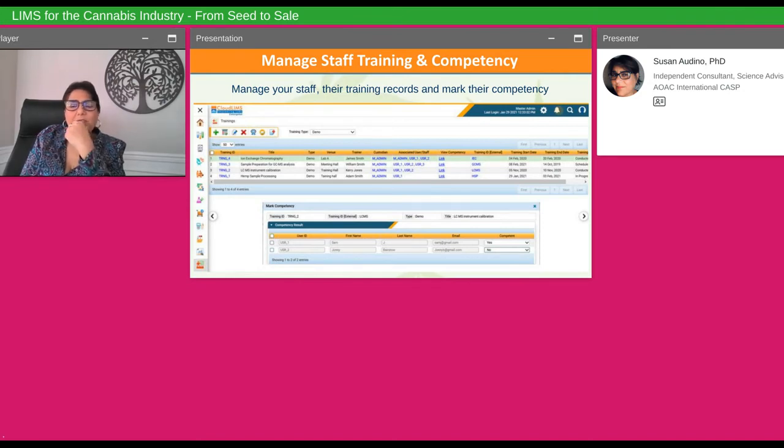Everything needs a demonstration or some clarification on competency and monitoring of that competency. These records have to be available. If they are not available, or if there is no record of training and competency, then it didn't happen.